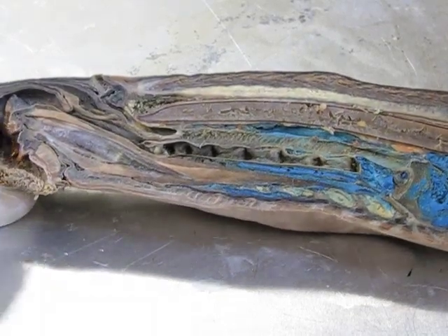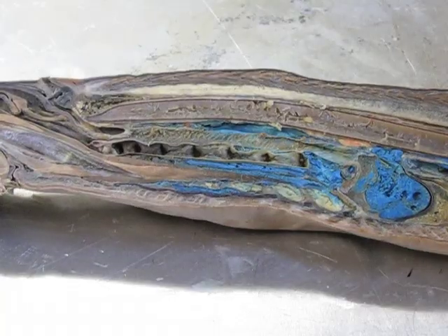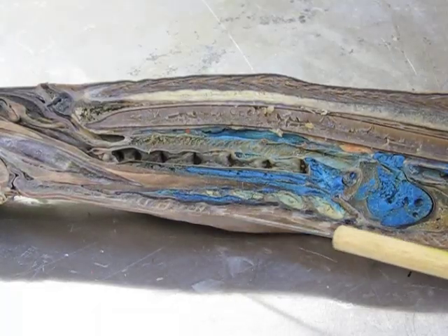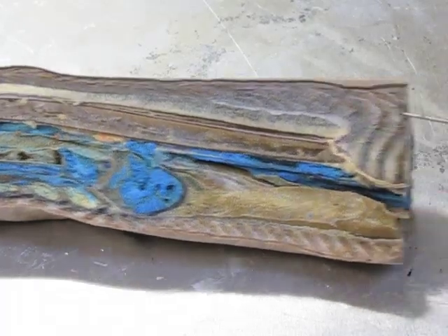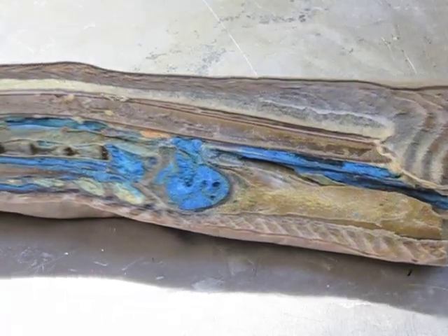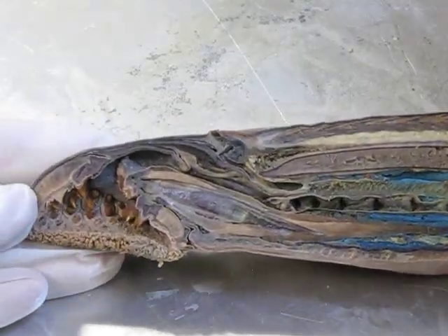We can also see muscles running along both the top and bottom of the animal — lines visible all along its length. There's quite a lot of muscle tissue here, which is used to propel the animal through the water and control its body movements.